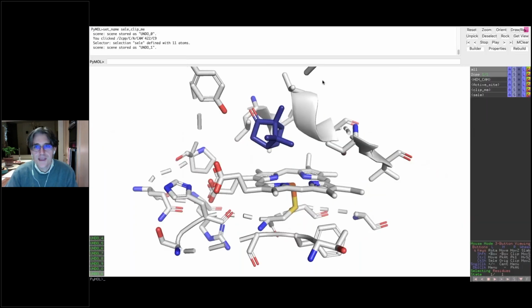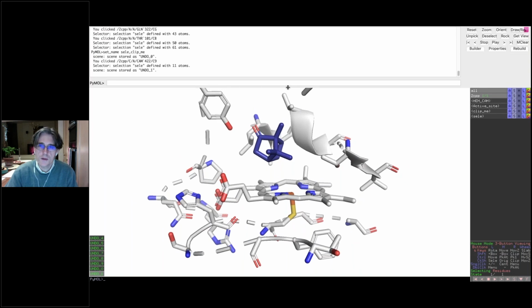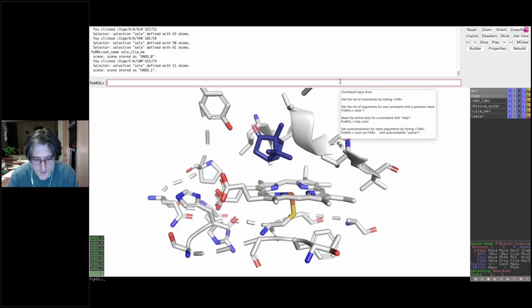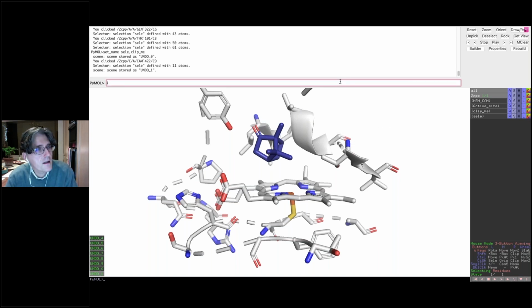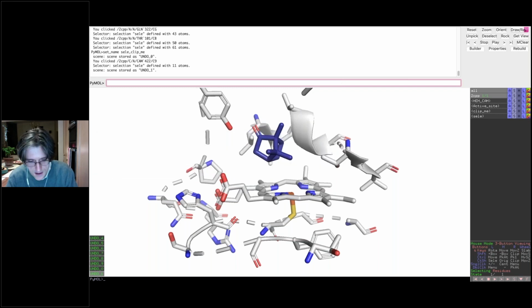Okay. I mean, you can certainly write your own scripts as well. PyMOL has its own language, PML, and you can also iterate through objects present and operate on them. That can be very useful, very powerful. You probably want to begin by saying something like, I think it's from pymol import cmd, I think.